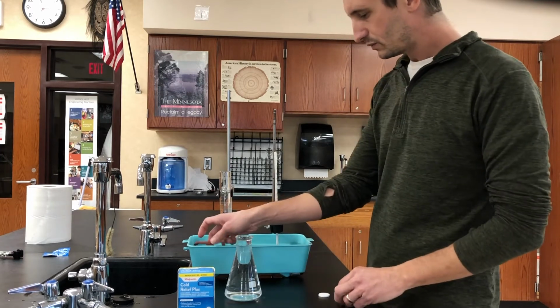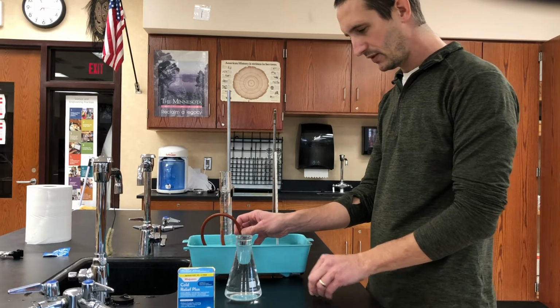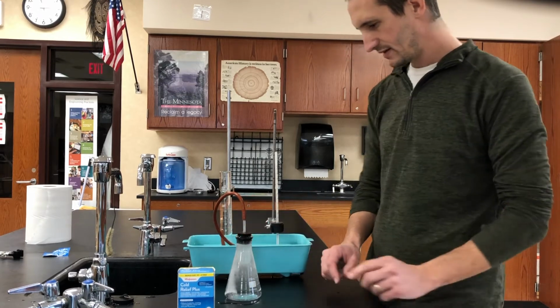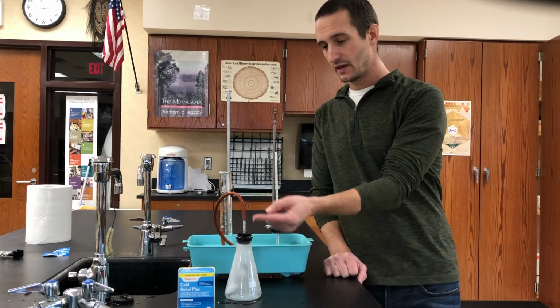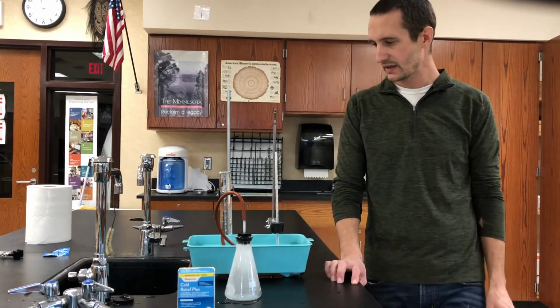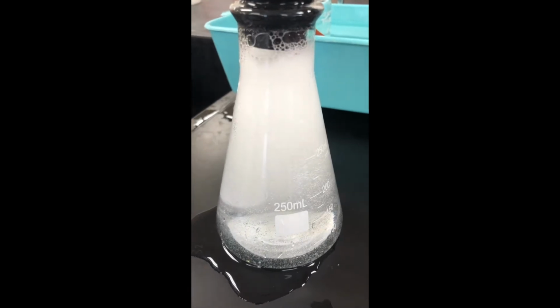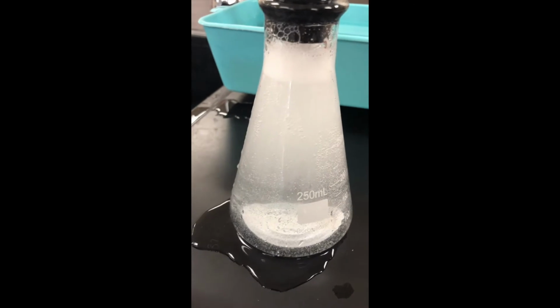So I need to get my Alka-Seltzer tablet ready, drop it in, and quickly cap it so that the bubbles that are produced inside of this flask move through the tube, and we are collecting that gas in the graduated cylinder. And we can take a closer look at the gas being collected.